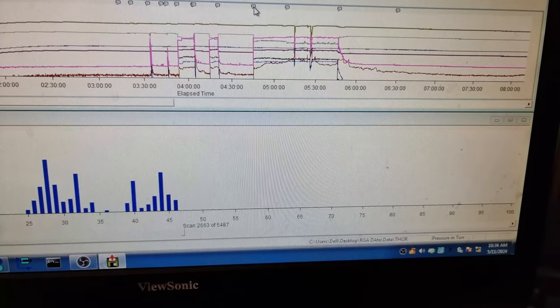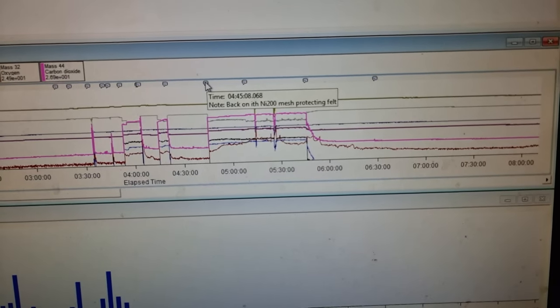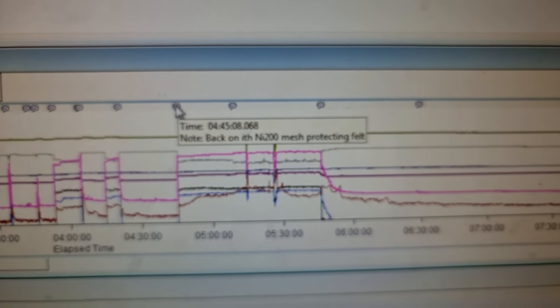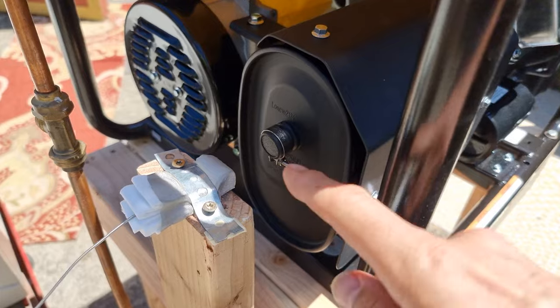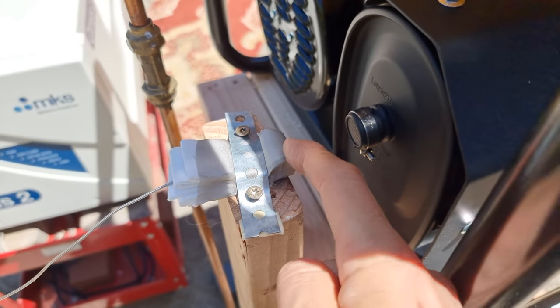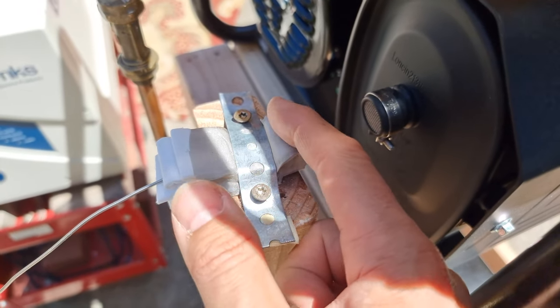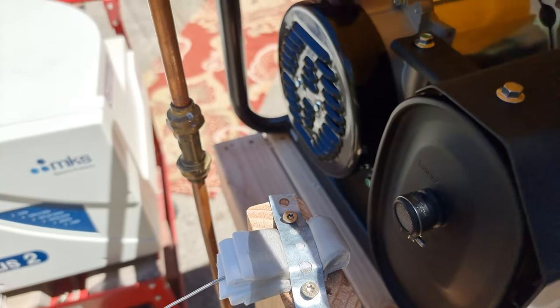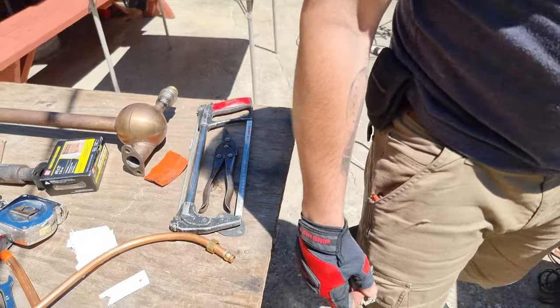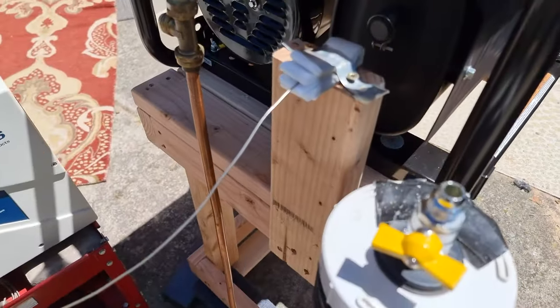Over here we attached a load. We had to put a new piece of nickel mesh over it to make it work without the filter falling apart — this is to stop large particulates going into the mass spectrometer and clogging up the pipe and the drift tube. So the flash arrestor is back on, this is absolutely stock. Now we have the Mark IV sampling arrangement with nickel 200 mesh and alumina foam behind, to stop the blast wave causing the foam to blow out. This is what happened to the last one — it basically blew through everything apart from the very last bit.